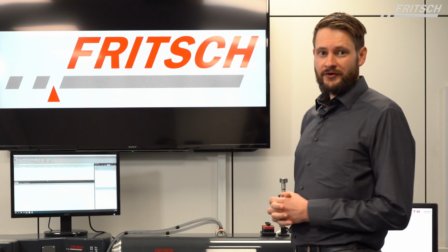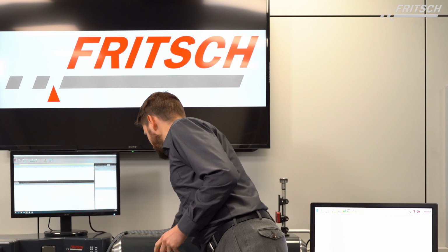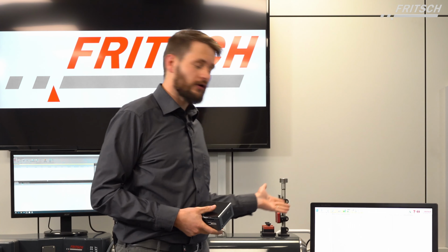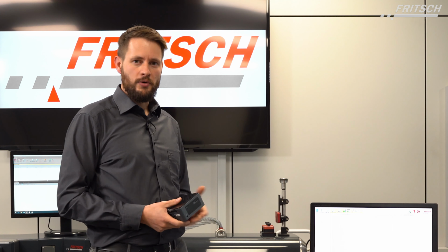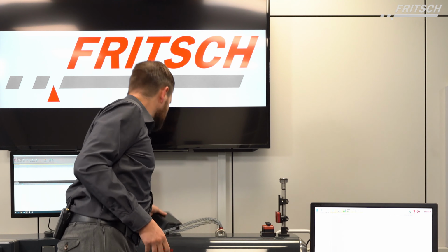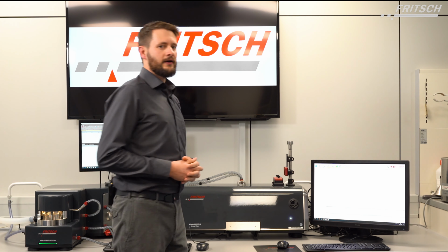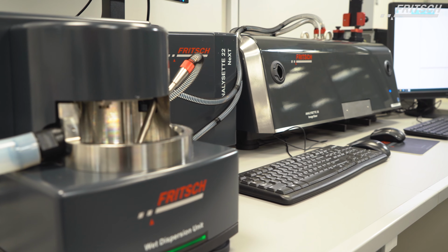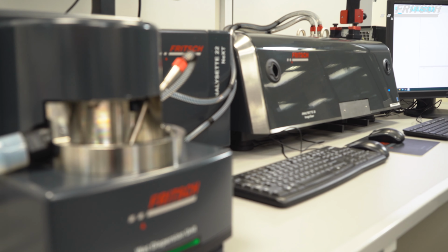In this case here, we have taken out the computer of the A22, installed the software on the computer of the A28 and are running both programs from one PC. Theoretically, you can connect the wet dispersing unit either with the A22 or with the A28. It is also possible to run either instrument individually.